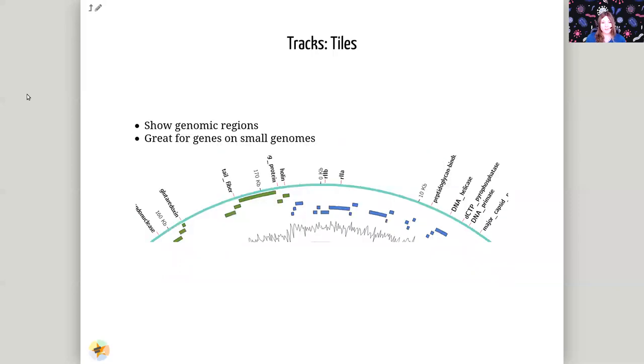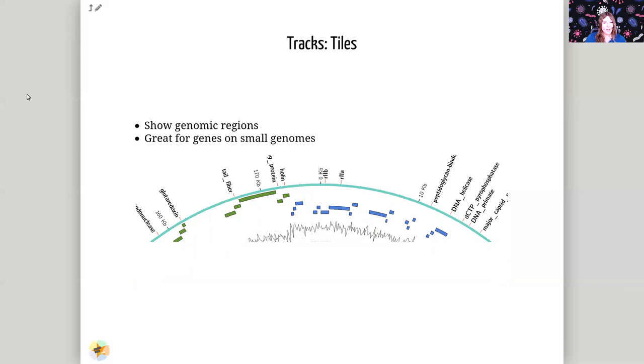Next up is the tile track type. This is often used for showing genomic regions. On display here is also the label track type. You can see the different text labels are arranged around the edge. This is great for genes on small genomes. Once you get to larger genomes, this track type is not so useful.